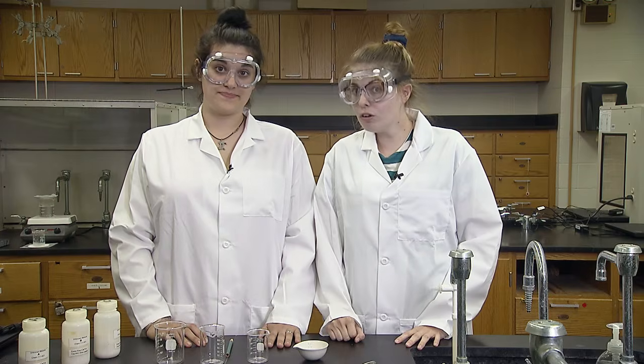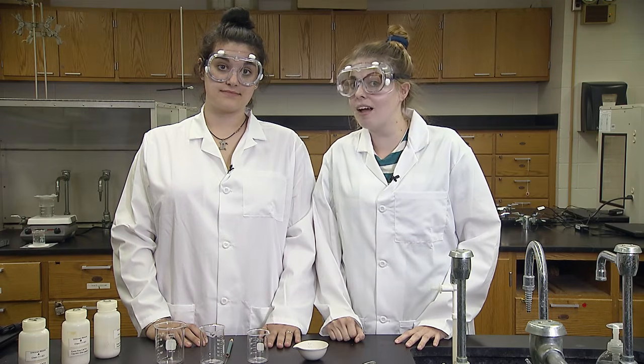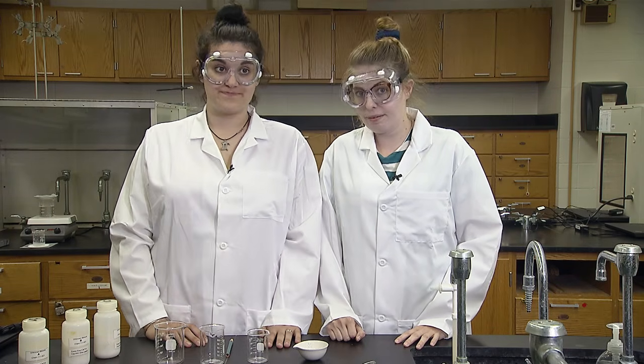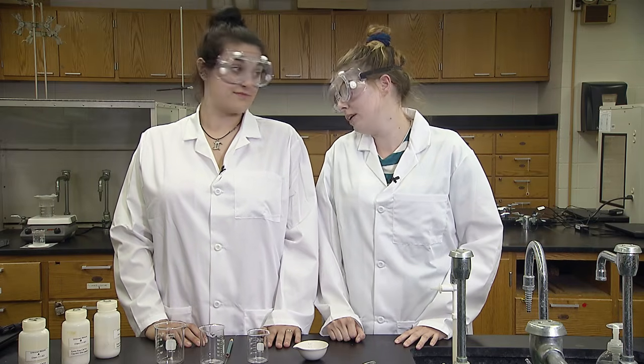Then we can filter it with water from the other solids. We will also use chemical properties like one of the solids reacts with acid. So each of the solids has different chemical and physical properties that allow us to get them apart from each other. Exactly. And once we have them separated, we can calculate the percent of each solid in the original mixture.